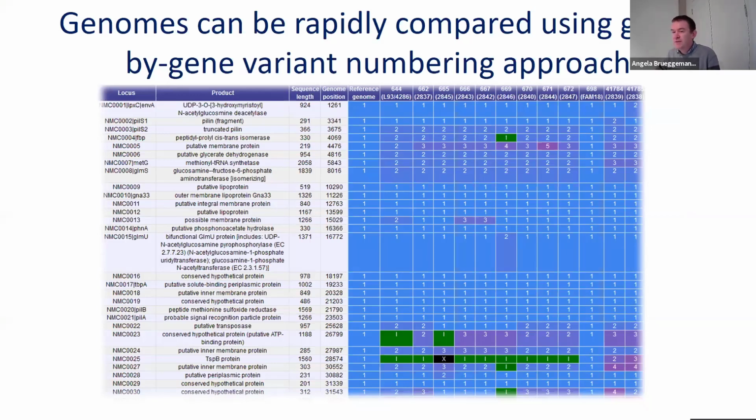For a long time, we limited at 1,000 genomes. But doing it that way, some jobs would take 3 weeks to run. And so you can imagine if you had multiple jobs running that take 3 weeks to run on your server, you could never reboot your server because there was never a time when it wasn't busy. And if you did reboot it, you would cause somebody to lose 2 weeks of analysis. And of course, as databases get bigger, everything just slowed down as well.